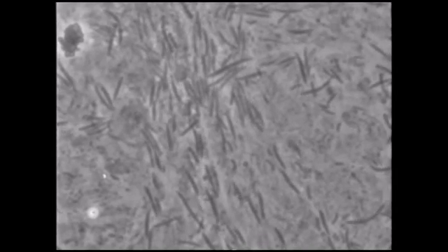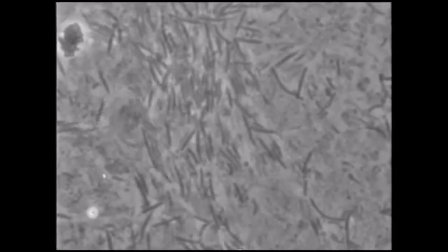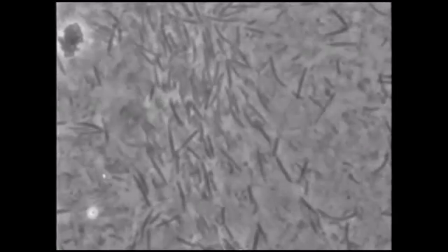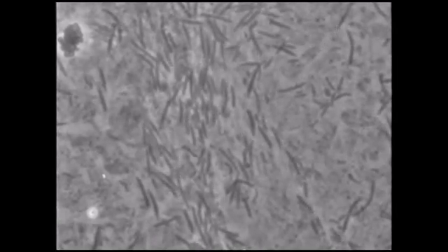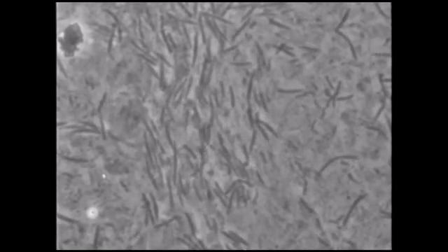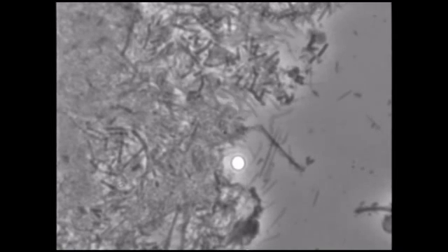This area shows an infection with large gliding rods. You can also see some spirochetes in the background. Bacteria tend to grow up in nests or colonies, and this is one with large gliding rods as the predominant organism. The segmented rods are reproducing rapidly, so you know this is a fast-growing colony.